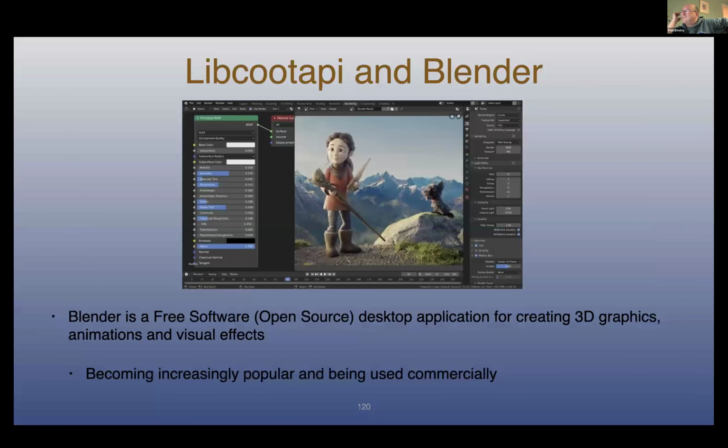Right, so last thing is to use Coot for interaction with Blender. As I said, the graphics have been stripped out and it allows us to add in extra heads. One of those heads is using the GUI of Blender, and so you have access to Coot tools in the Blender interface.